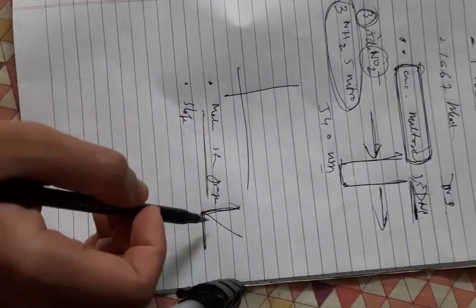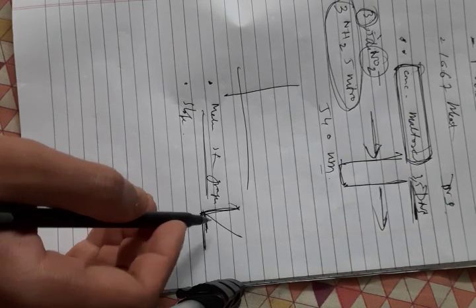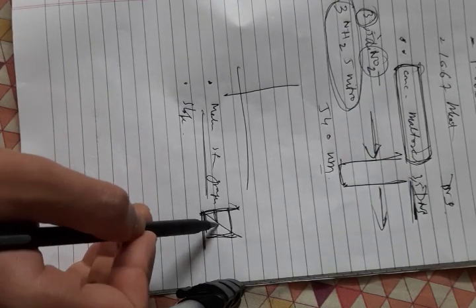If we find the slope, then on finding any OD, we can find out the concentration of the maltose, even if we haven't tested for that one, because it's a straight line.